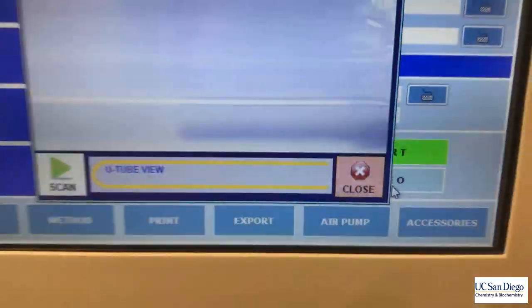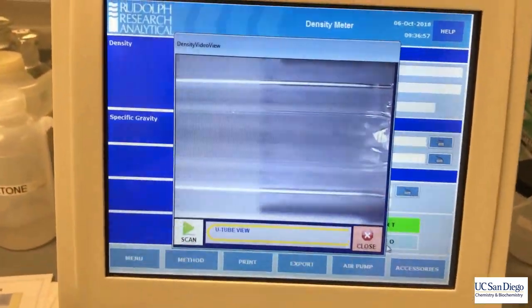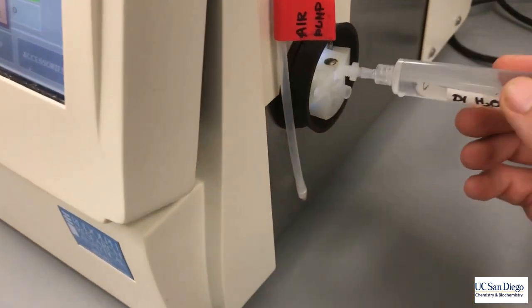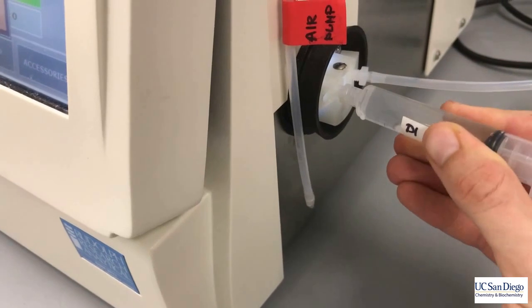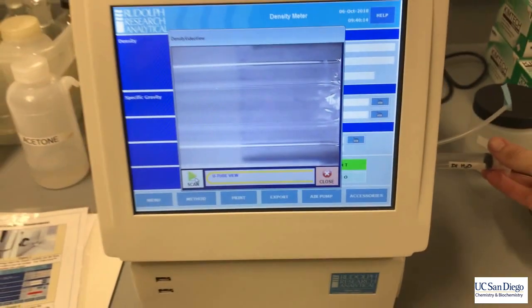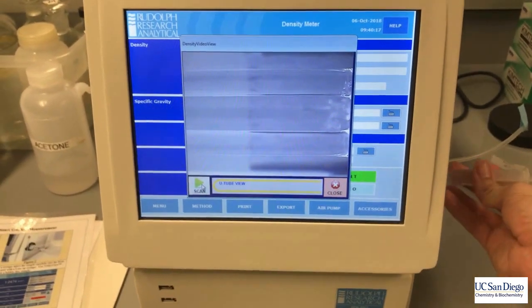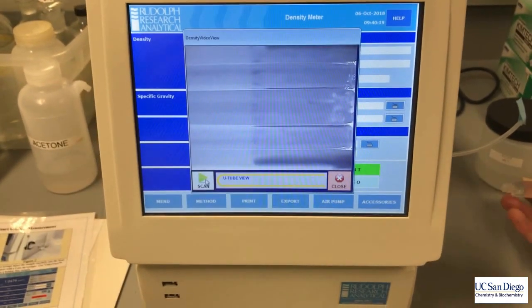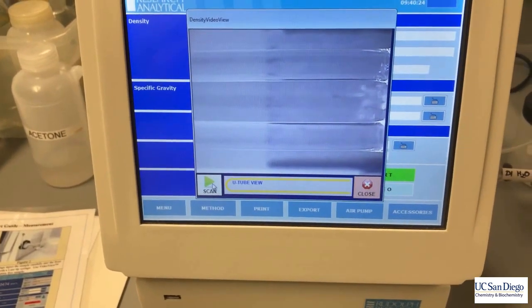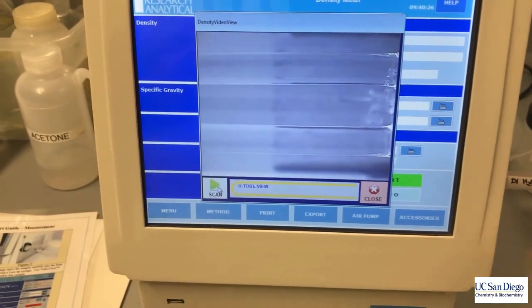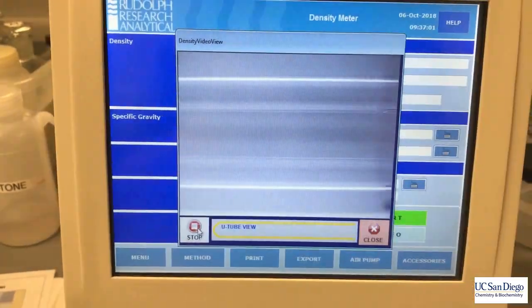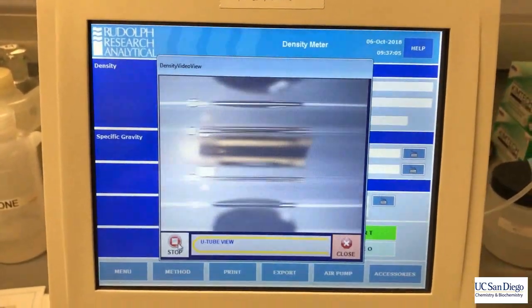We can also view the U-tube that contains the sample to check for any air bubbles. First, let's inject our DI water so we can get a reference for how the instrument is performing that day. You'll see those air bubbles flow through — more air bubbles — that's what you're going to be looking for.